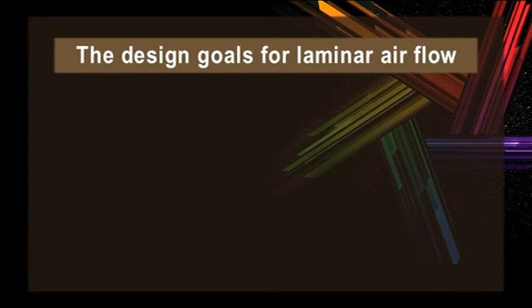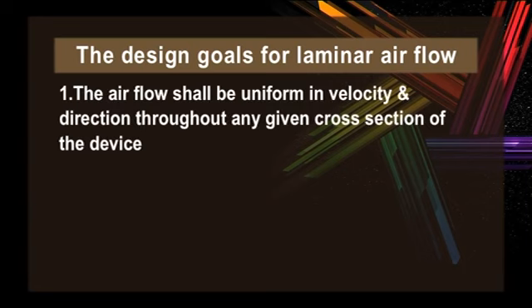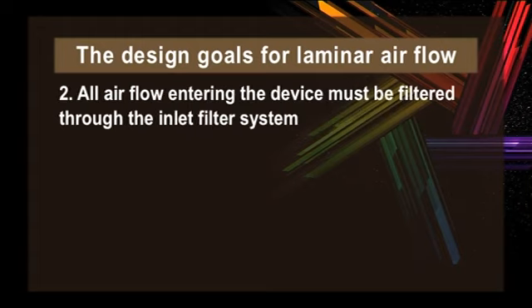Experience with laminar airflow equipment has shown that careful design, construction and operation are necessary to obtain maximum benefits. The design goals for laminar airflow devices are that the airflow shall be uniform in velocity and direction throughout any given cross section of the device, and all airflow entering the device must be filtered through the inlet filter system.